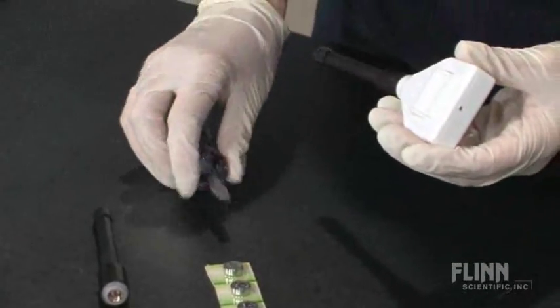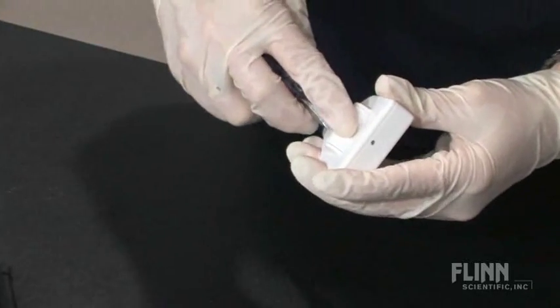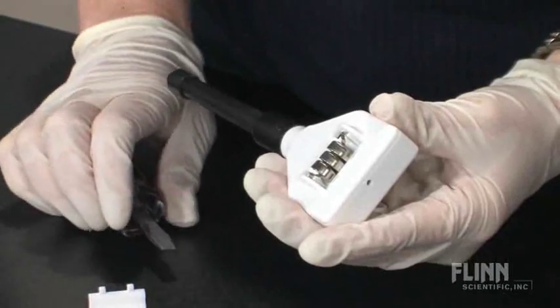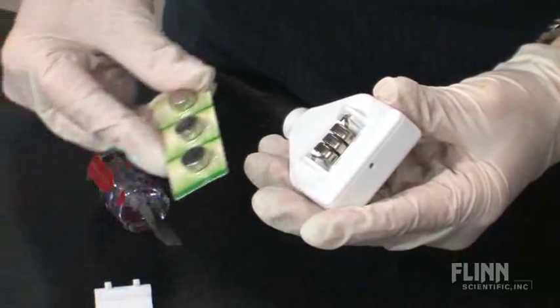On many portable pH meters, the batteries and electrodes may be changed. If you need to replace the batteries in a Flinn pH meter, remove the battery cover and replace the batteries.